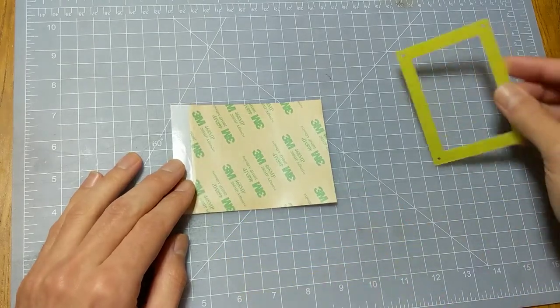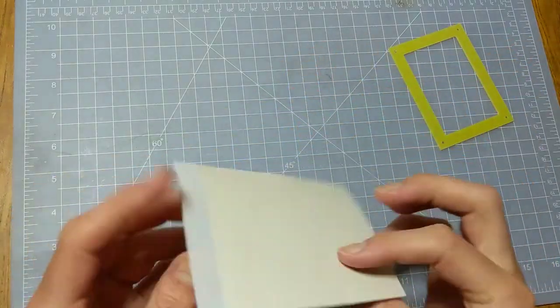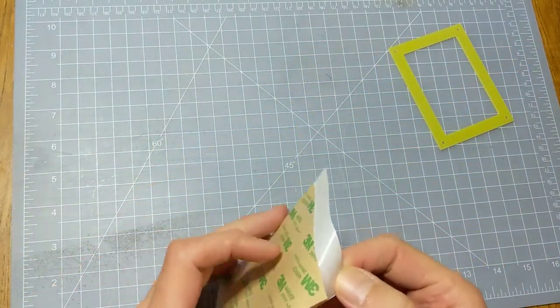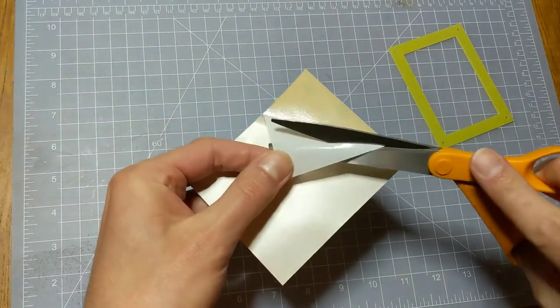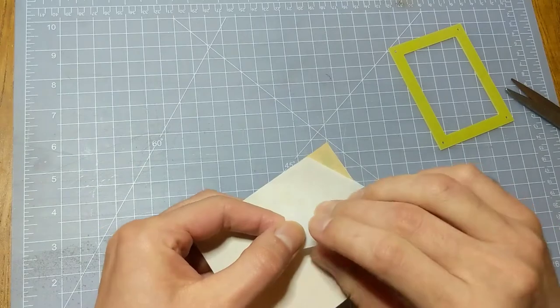So we'll peel off the backing, and one trick here is to use a little scrap piece of the backing as a tool for handling, otherwise the adhesive is pretty sticky and hard to handle.